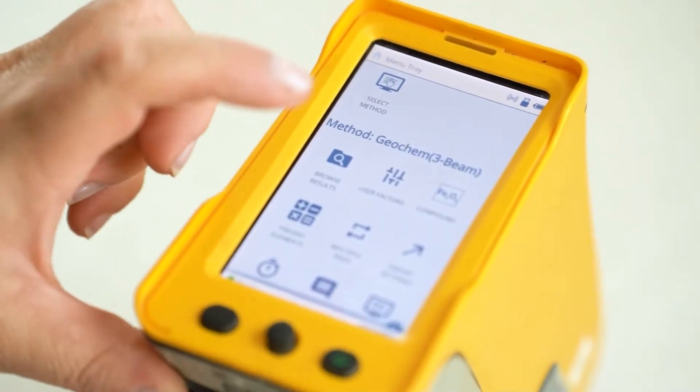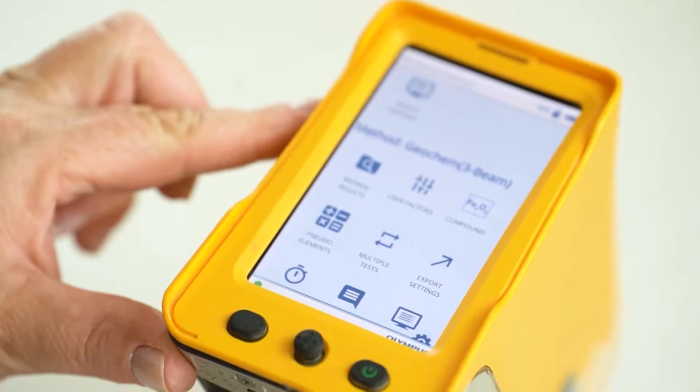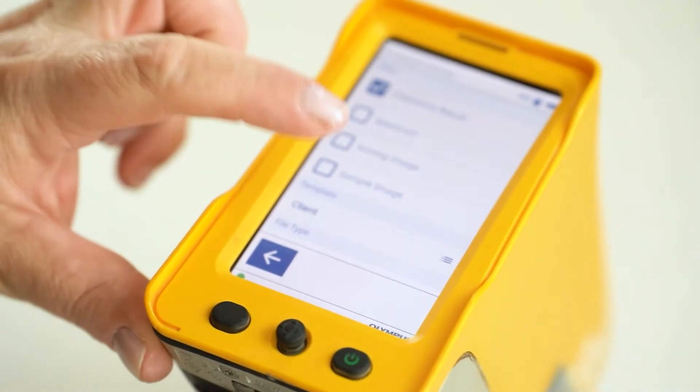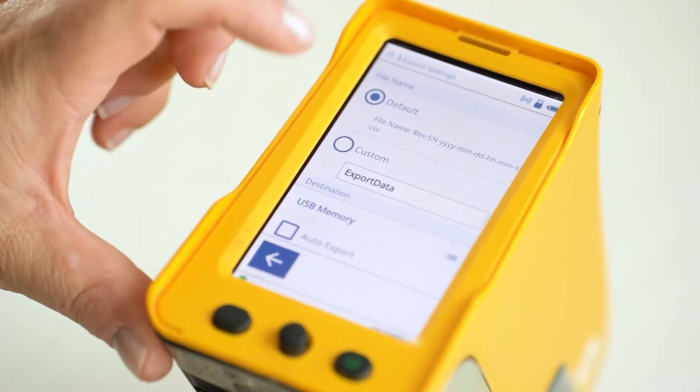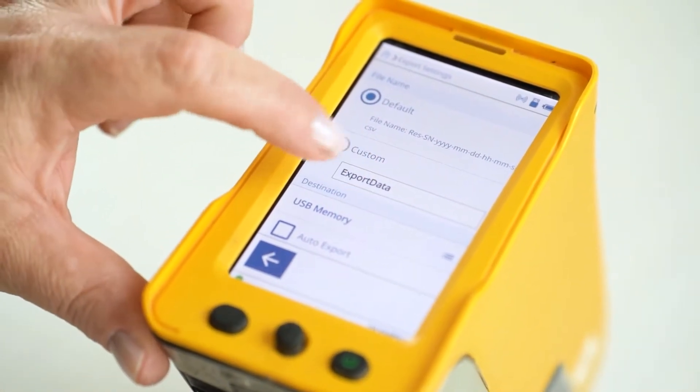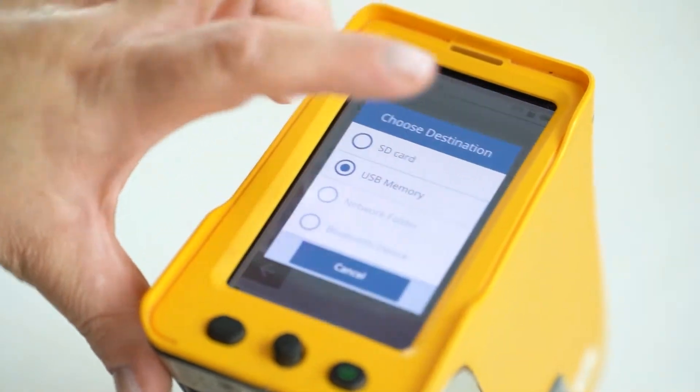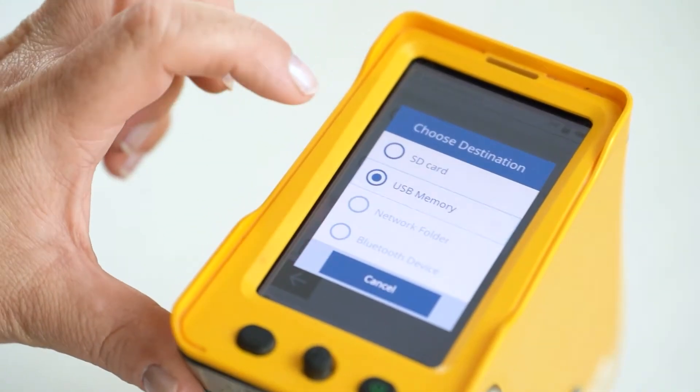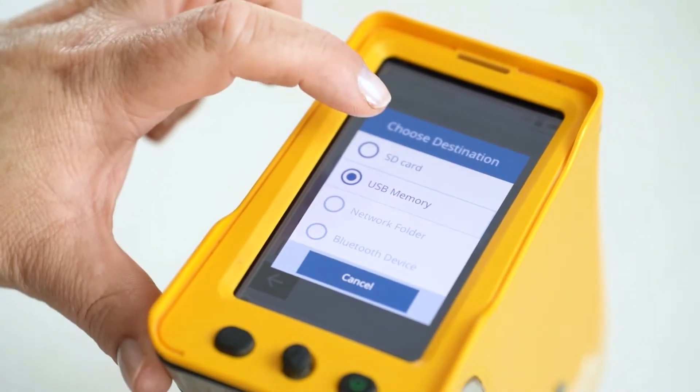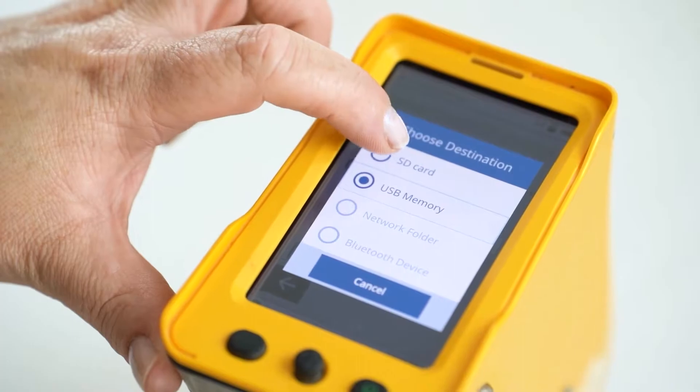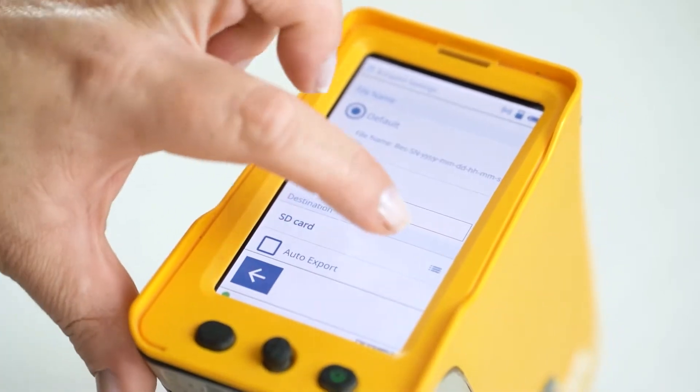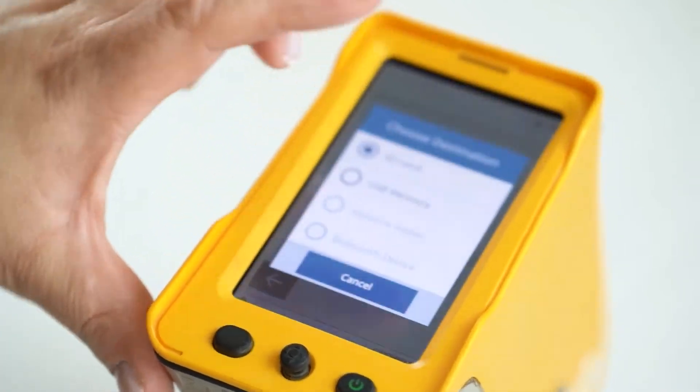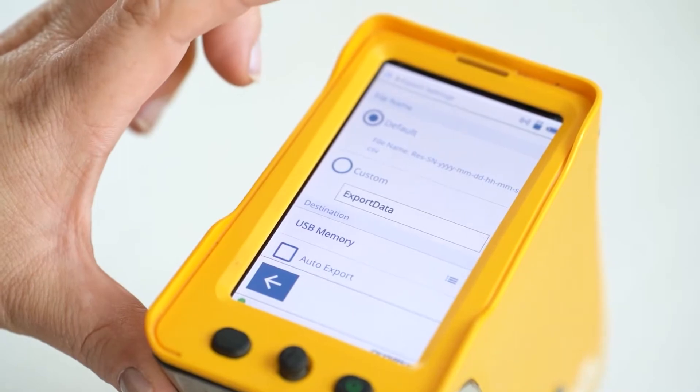You want to press on export settings. You want to scroll up and there's destination. You will click on that and make sure it's set to USB, or you can just click on SD card if you want it to go there, but we want it on USB.